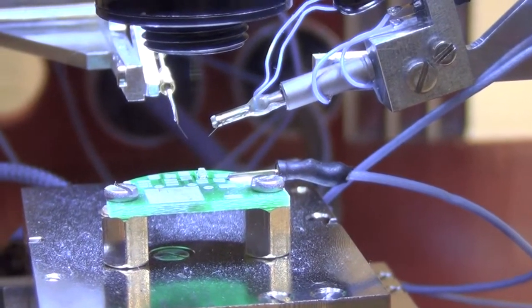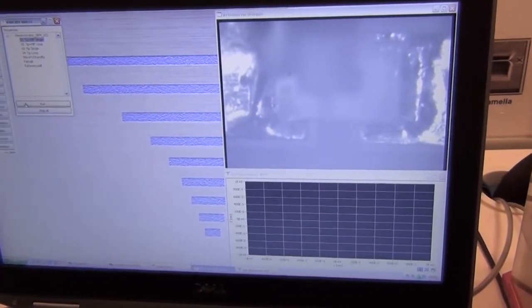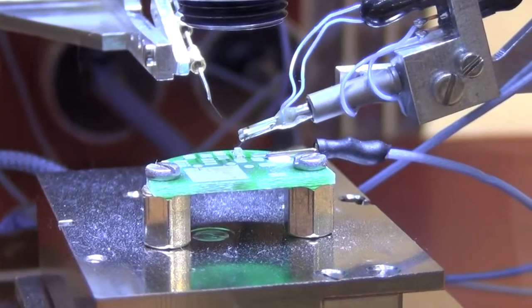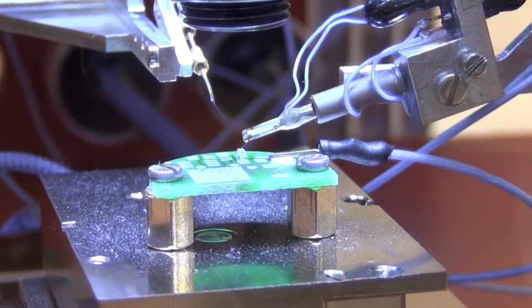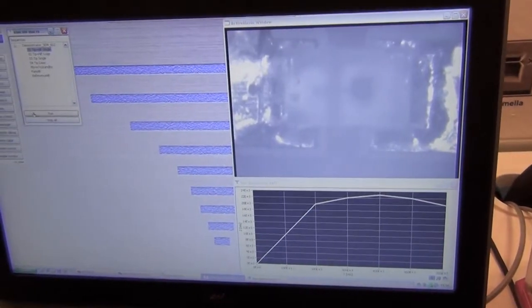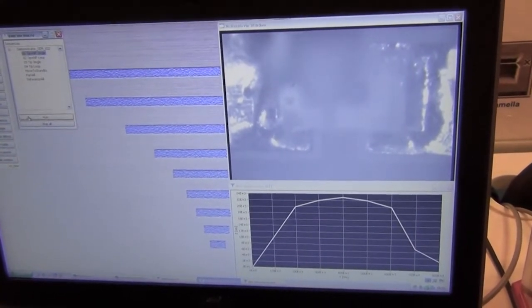There we start an automatic macro. We'd like to land an electrical probe, but before we do this, our nanofinger, a special instrument, comes to the field of operation and detects the surface height and topography to find a nice landing area that is flat for an electrical probe. So that's now first the nanofinger detection.